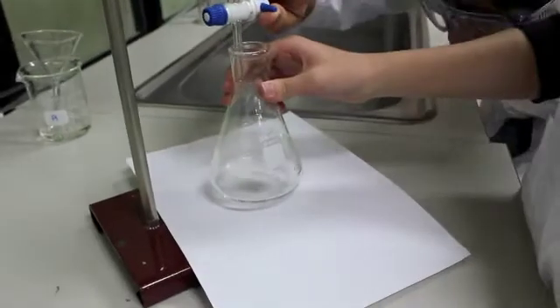The graph you see is the graph of acid and base. The equivalence point is when the solution is neutral at a pH of 7. The endpoint is where the indicator changes color. This point is not at 7, but a bit above. The endpoint is where you would know that your titration experiment is completed.